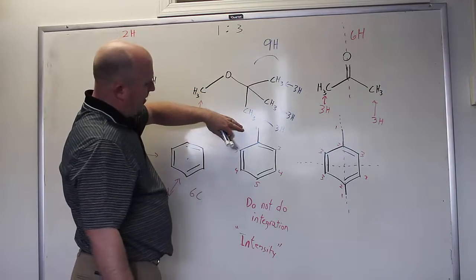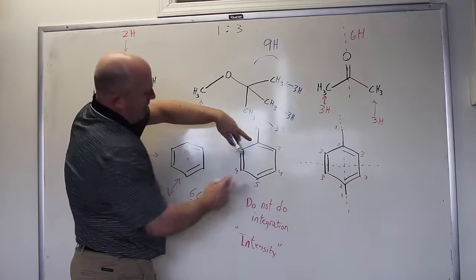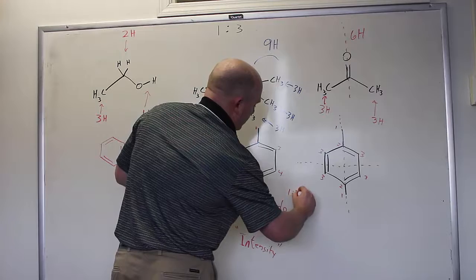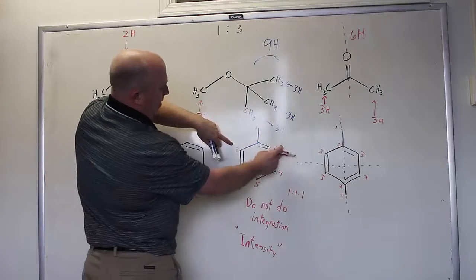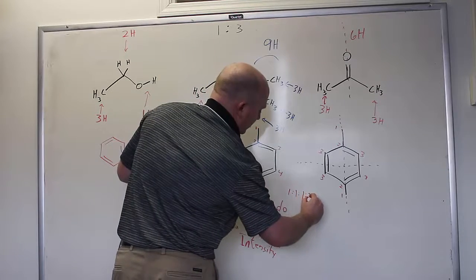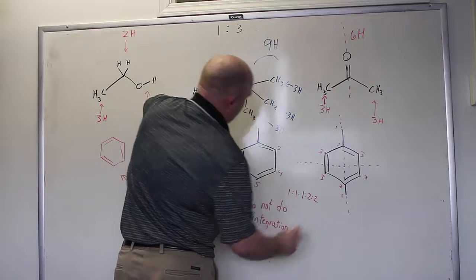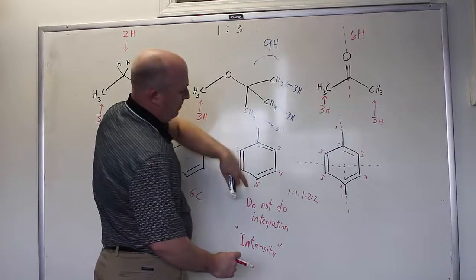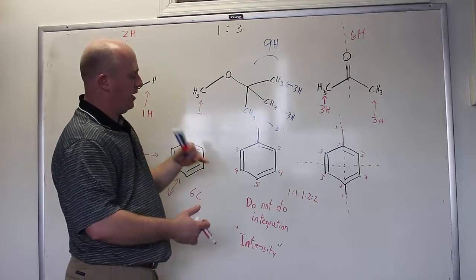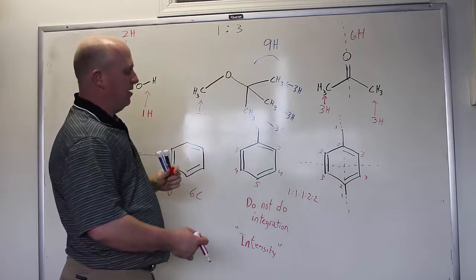So what do we expect to see for this molecule? We expect to see 1, 2, 3 carbons that will all be the same size. So a relative height of 1 to 1 to 1. But then environment number 3 has 2 carbons in it. We expect that to be twice as tall. And environment number 4 has 2 carbons in it. We expect that to be twice as tall as environments 1, 2, and 5. So intensity, the height of a carbon NMR peak, is information that essentially correlates with the integration in proton NMR.